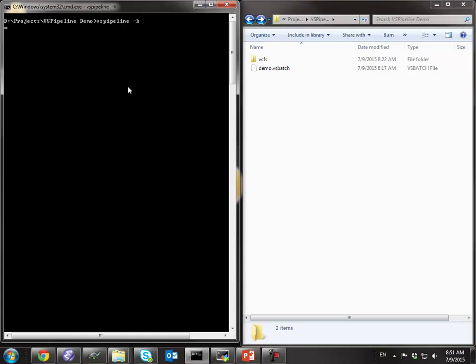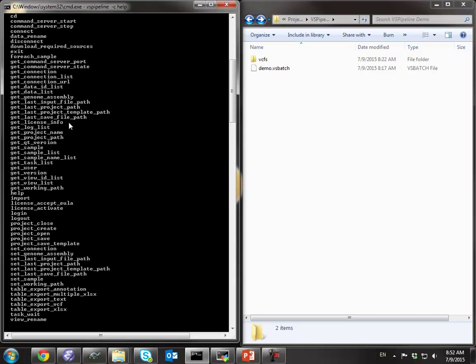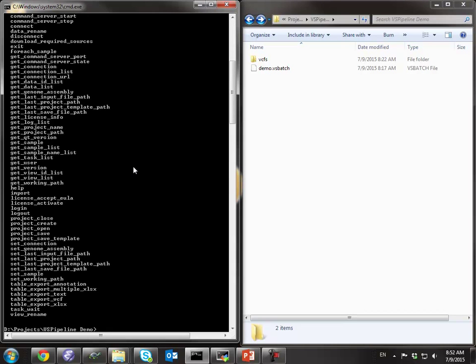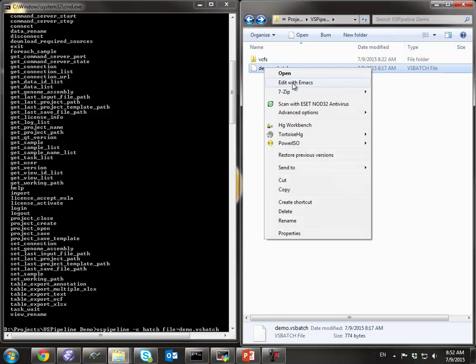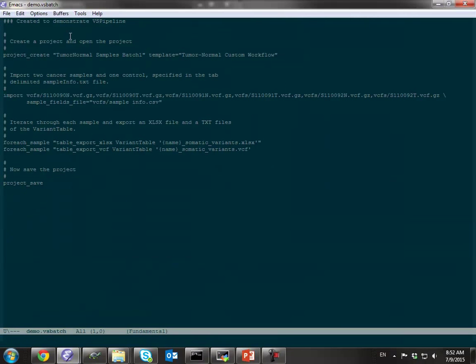VS Pipeline is in my path, so I can run it with a dash H to see its commands. You can actually run it in the interactive shell mode, or you can run commands such as the help command here, and that will give you a sense of how many commands we have available. We're going to run it in batch mode by running a batch file — this demo.vsbatch. Before I run that, I'll give you a sense of what this does.